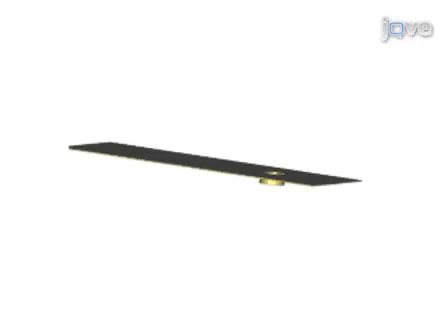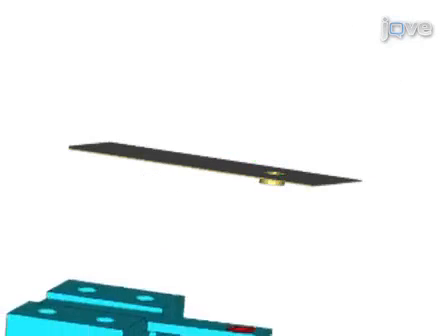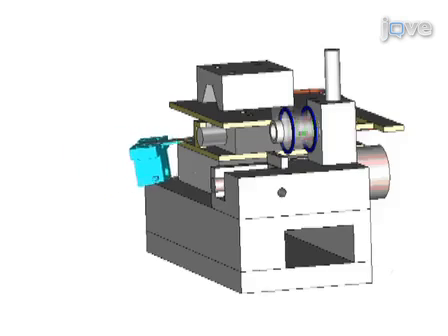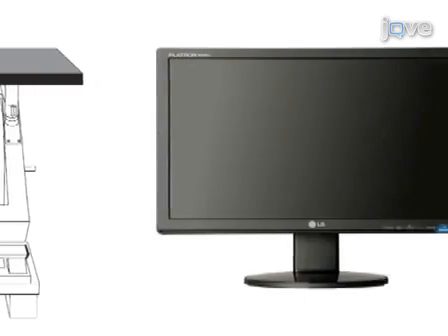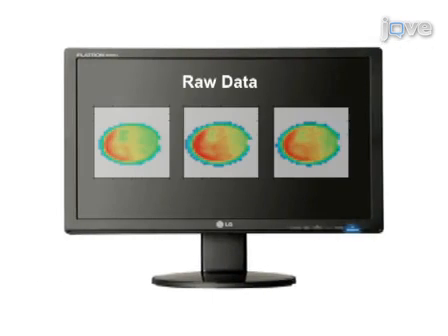This is achieved by first preparing a sample of cyanobacteria cells inside the ESR microscopy sample holder embedded in stable organic radical solution. The sample holder is placed inside the imaging probe, which goes into the static electromagnet of the ESR microscope system. Now, several three-dimensional ESR microimages of the organic radical solution are acquired by the ESR microscope.